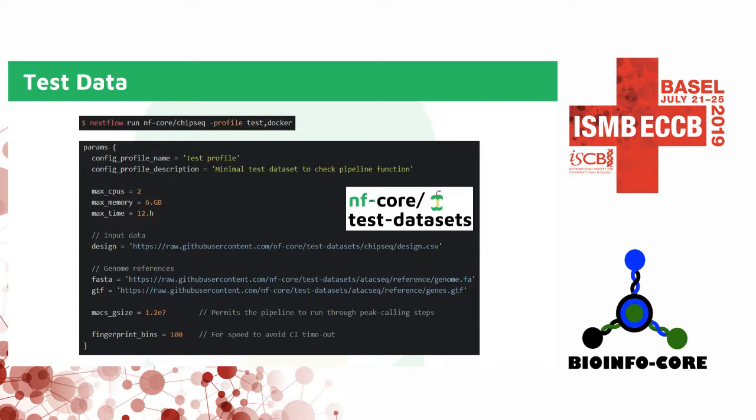It's just a design file. It's a simple yeast data set that is downloading some publicly available data that's been subsampled to, I think, 100,000 or 1 million reads, which is ample for yeast. And this will then get run if you just provide profile test.